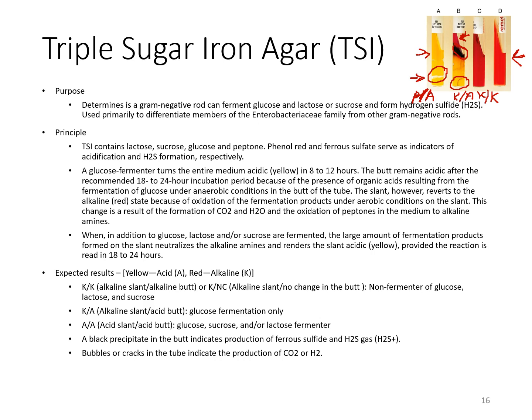Depending on the organism, sometimes it will actually just kind of shred this agar and it'll be broken up all the way through. But most of the time you'll just have a little bit. Sometimes you can have an agar slant that will actually push up from the bottom. So there'll be like a little layer of air at the bottom, and then all of the agar would be through here.